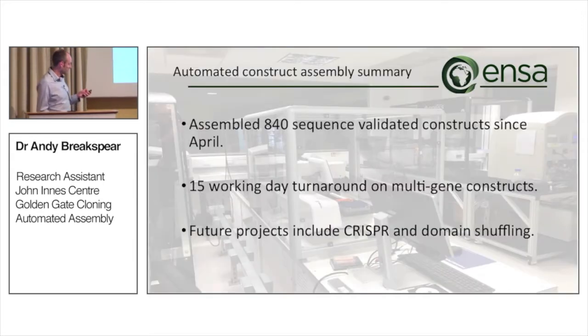So just to finish, I wanted just to summarize the platform. So this is a hobby for me, building constructs. My day job is doing RNA-seq experiments across the road. But every now and then I pop down for some therapy and come and use the robot. So we've put together 840 sequence-validated constructs since getting the first robot in April. With just me operating this, we're looking at 15-day turnaround, and most of that is coming from sequencing the intermediates that we're producing.